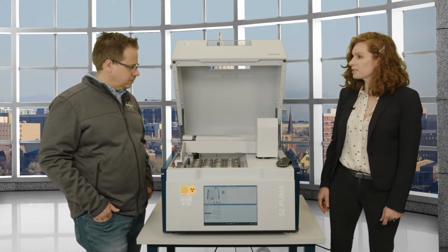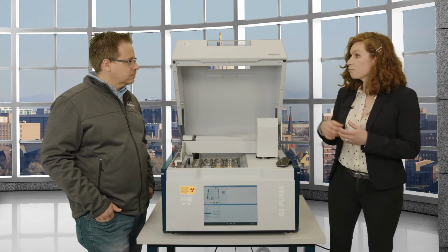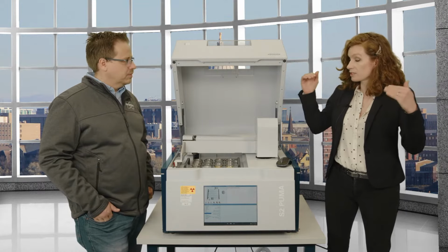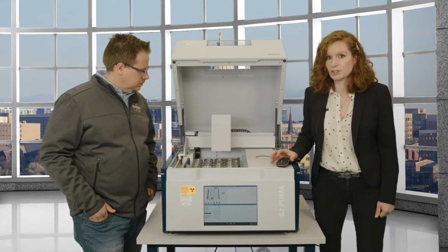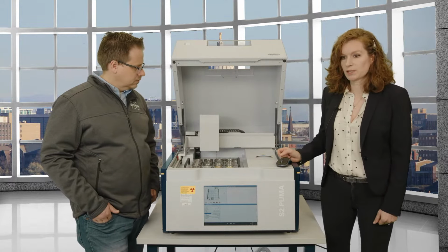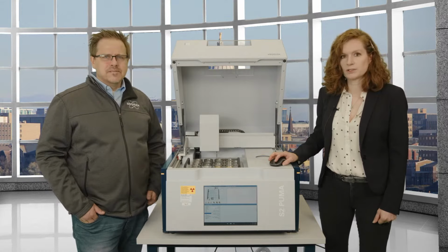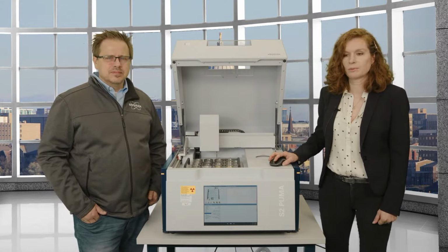And then the cool thing is, right, because EDXRF measures the spectrum the whole time, and at all times it just accumulates counts, we can actually look at the spectrum while it's taking it. For that, we need to look back at the touch screen, although we have a little bit of time.